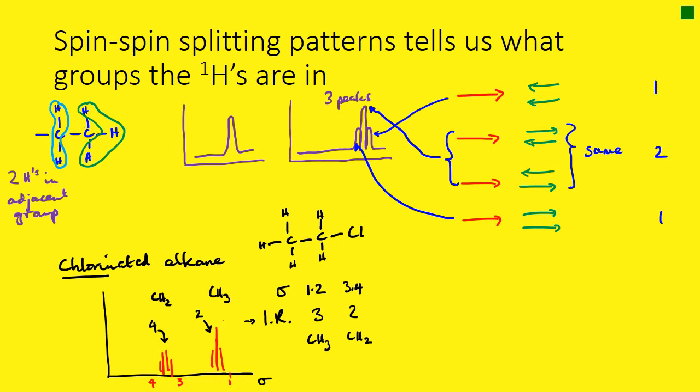Okay, so let's summarize the splitting patterns into a rule. It's called the N+1 rule.